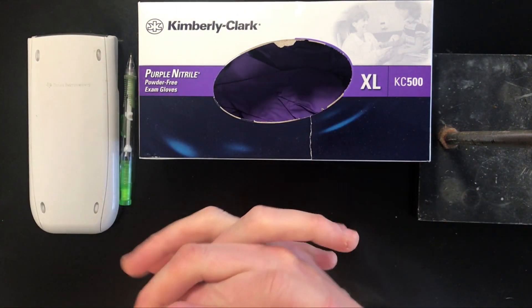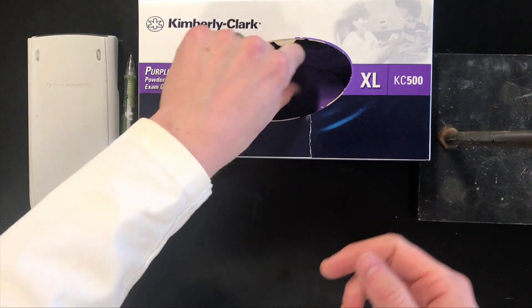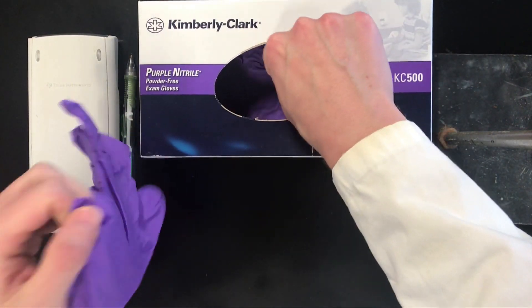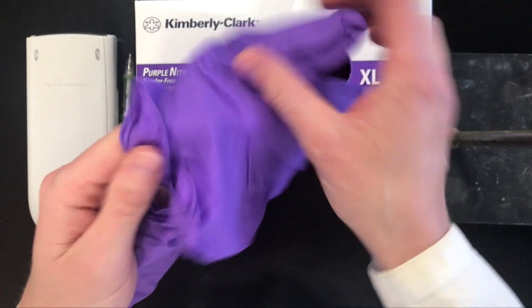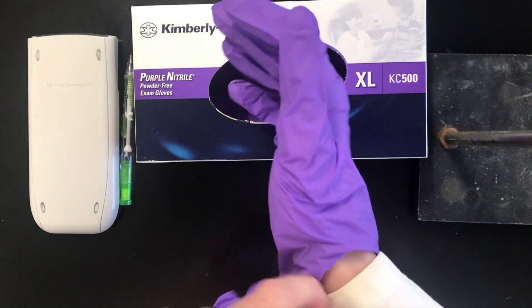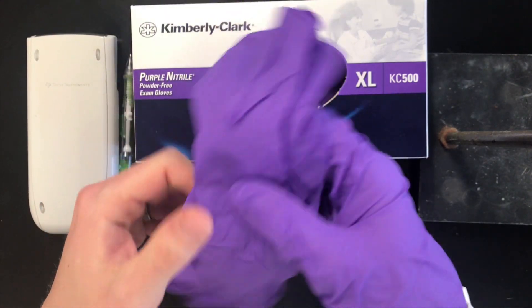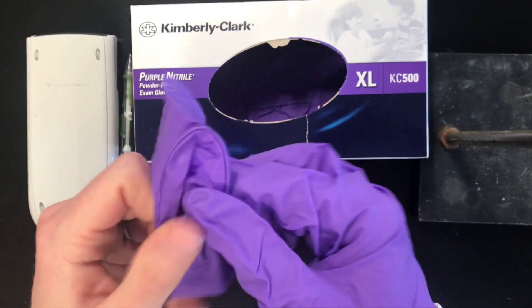The first piece of advice I would give you is just to choose a size of glove that fits you well. For me, that's extra large, but we've got sizes running from extra large to extra small. And if your lab is low on gloves, don't hesitate to come to the stock room. We have more than enough gloves — this is Georgia Tech, we have plenty of funding. So don't hesitate to change your gloves and get more when they run out.